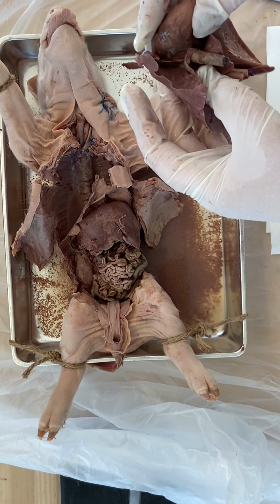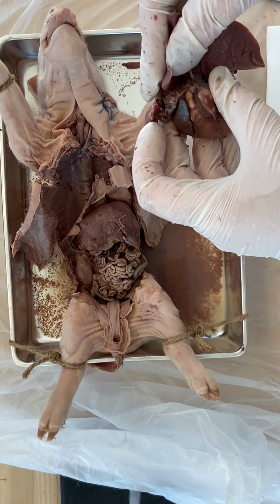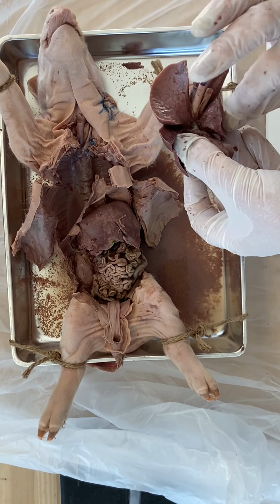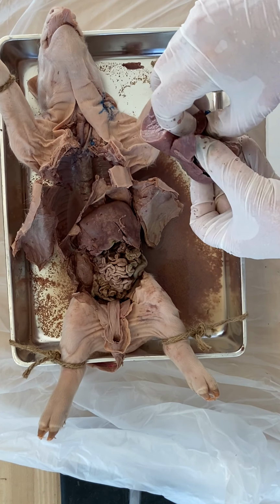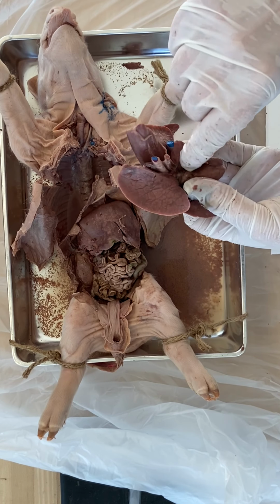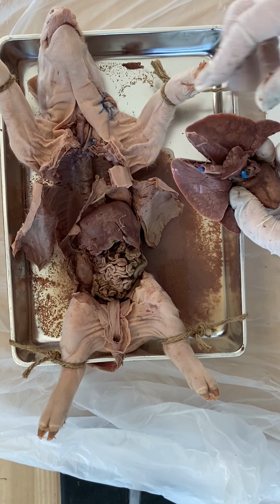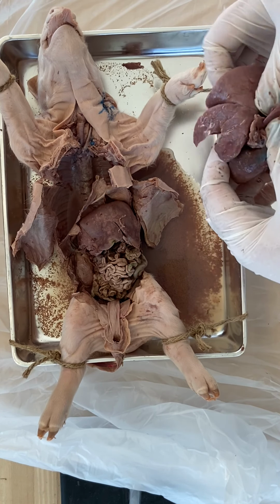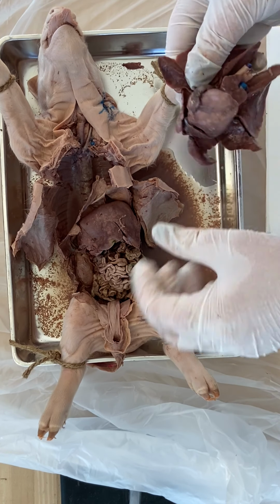All right, so let's see if we can separate off the lungs, which of course we don't want to. Those are far more in pieces, I think, than ours. There looks to be the sort of wayward lobes. Maybe they're just more separated than ours? Probably because of the shape of the pig, the shape of the body that they're trying to get into. All right, let's see if we can get up.